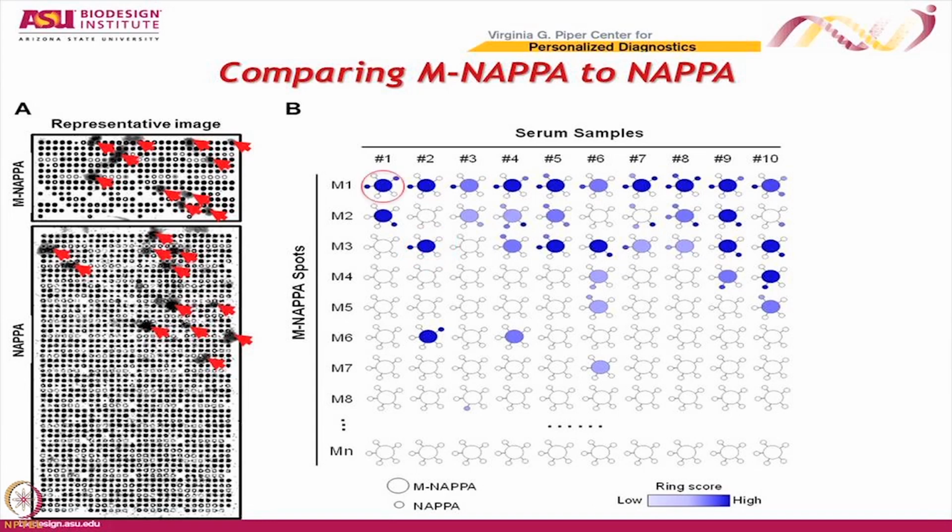Then here's another example where we had a strong spot signal, and there were 2 positives in that mix. So that's something that you have to keep in mind, is that up until now I've been acting like within every mixed spot there's only 1 target. It's certainly possible that there may be more than 1. And obviously you hope that the mixed spot will give you that signal.